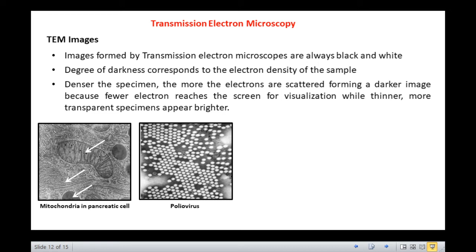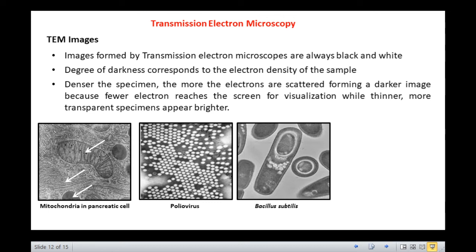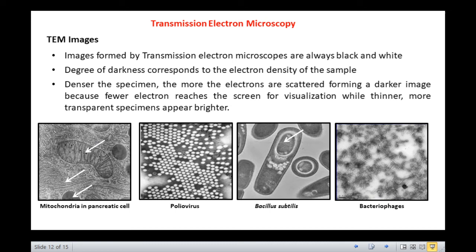Students, this is Bacillus subtilis, the rod-shaped bacteria which we are very familiar with. Just see the endospore inside the bacterial cell. The next picture is that of bacteriophages, viruses which infect bacteria. The darker areas of the image represent those areas of the sample that fewer electrons were transmitted through because they are thicker or denser. The lighter areas of the image represent those areas of the sample that more electrons were transmitted through because they are thinner or less dense.